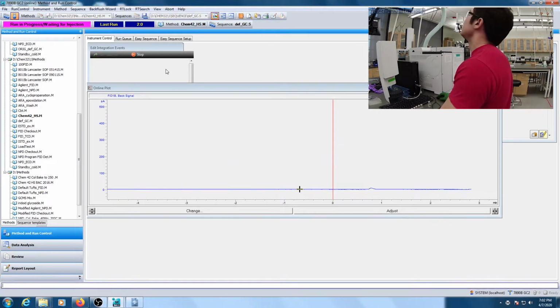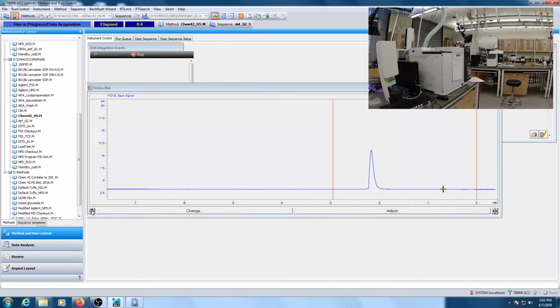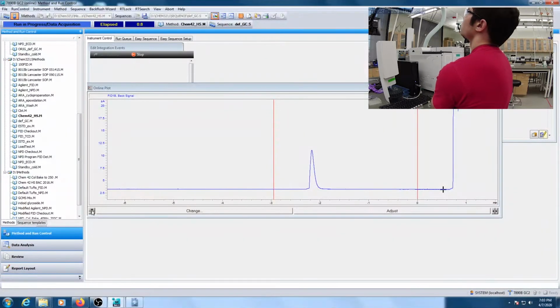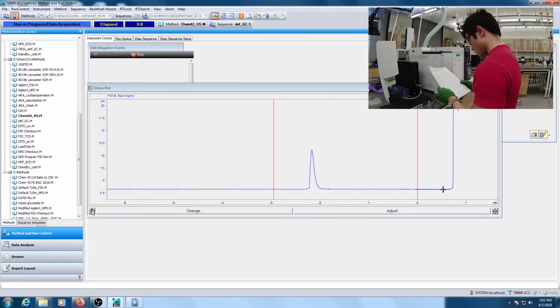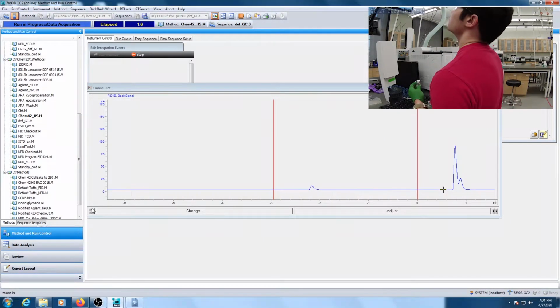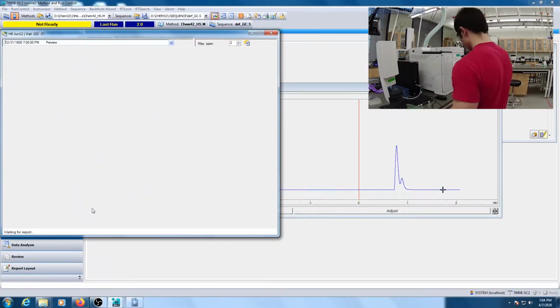Here I'm injecting the R2 sample, which is going to be a mix of the ethanol and propanol, so this will also tell us what the ethanol retention time will be. So if you look at the report for the R2 solution, the ethanol comes out at 0.773 minutes and the propanol came out at 0.883 minutes. Any discrepancies in retention time is probably just from the time between injection and me hitting start on the GC-FID.